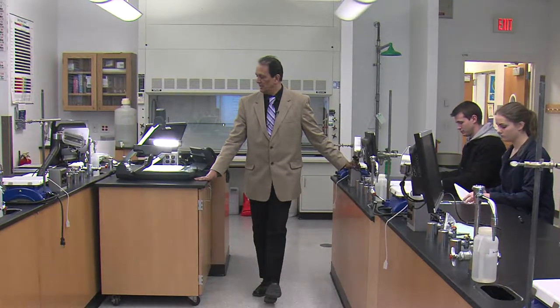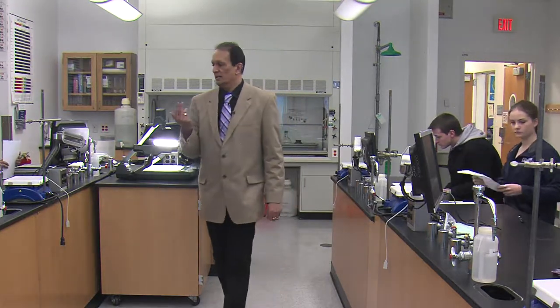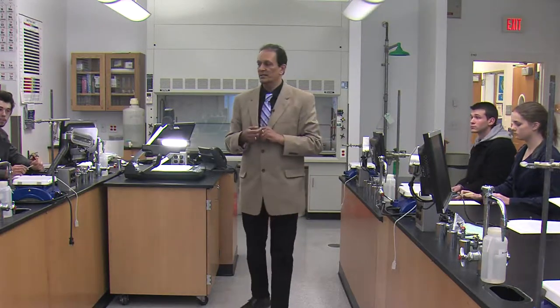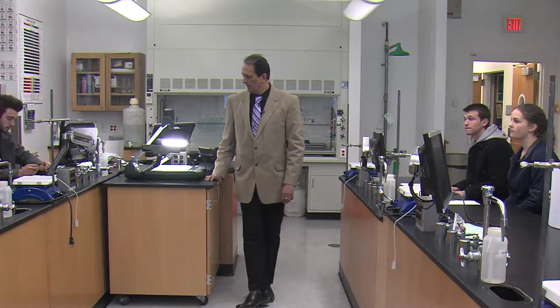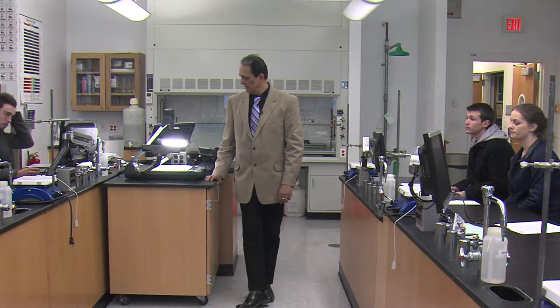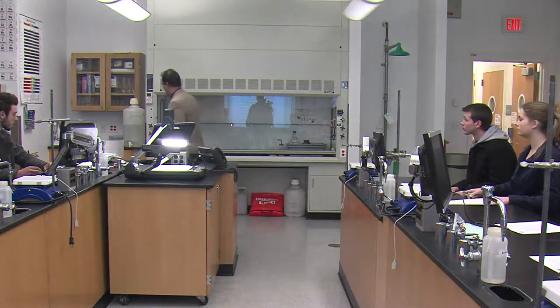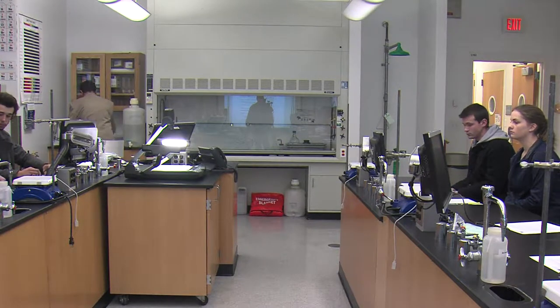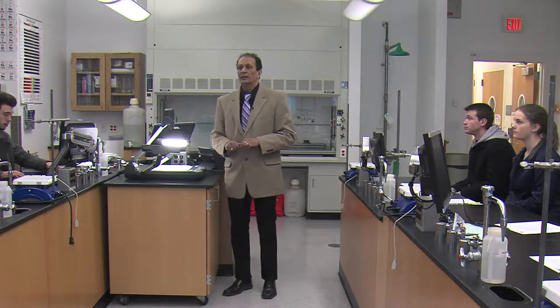And as we discuss safety policies, we will discuss the evacuation plan, and I will show you certain safety features that are present in this lab, all right? So as soon as everybody gets a copy, we will discuss these, and then we will sign these copies, and you will turn one in to me. All right, did everybody get one?